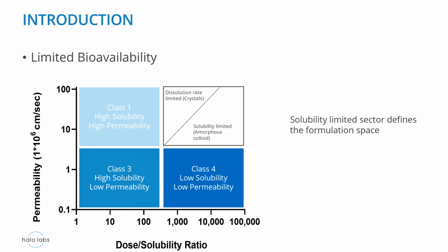Crystals are a kind of an energetic solubility trap, and they don't allow compounds to solubilize very easily. So if you see amorphous colloids, you are solubility limited, but at least in this space, this is called the formulation space. Using formulation, you can improve the solubility of your compounds to try to make them more drug-like.